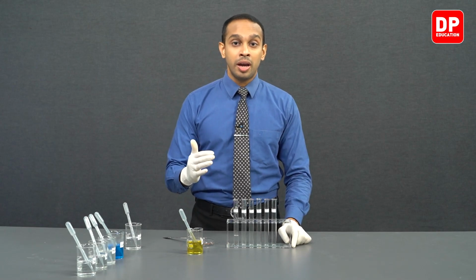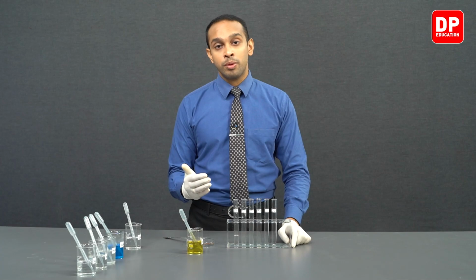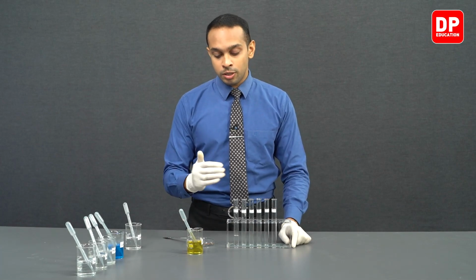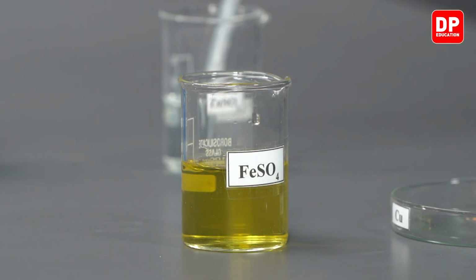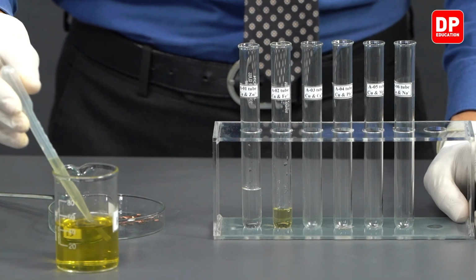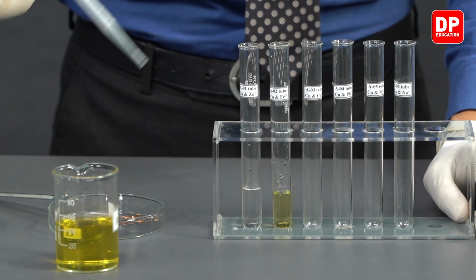If you need to have a fresh solution each time you do this experiment, then you can prepare a fresh Fe2+ solution and then proceed with the experiment. So still the solution can be used. It has a green hue. So we will be taking roughly around 5 milliliters of the solution into our second test tube.